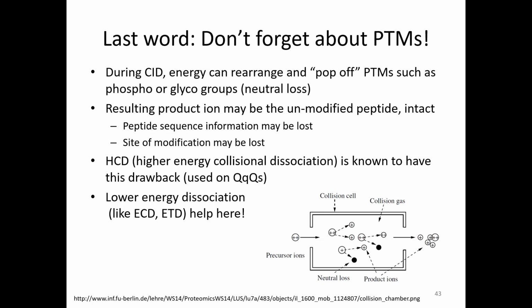While they may not be isotopic versions of your peptides, you might have something that you can use as a less expensive standard to just make sure what the instrument's doing to the peptide, and then make sure that your peptide is behaving similarly. So again, PTMs are a little more tricky.